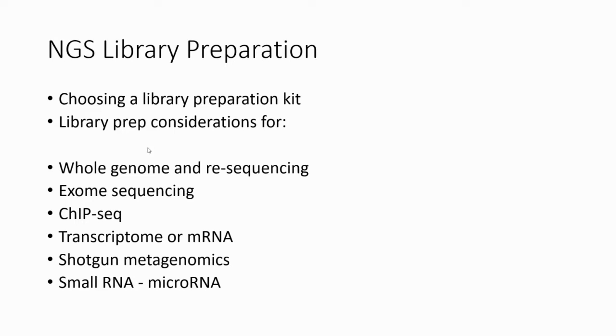For NGS library preparation, you have to choose a library preparation kit, which can be customized or commercially available. In library construction, you prepare the nucleic acid target.